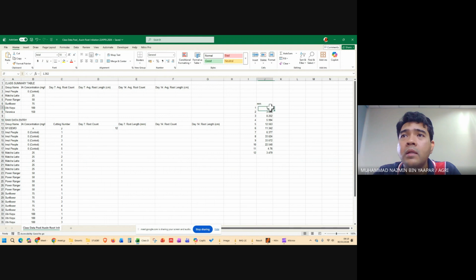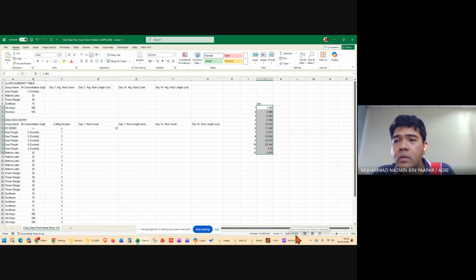And for the summation of this, you need to get the average for, no, you do not need to get the average. You just need the summation of this, which is 147.659.